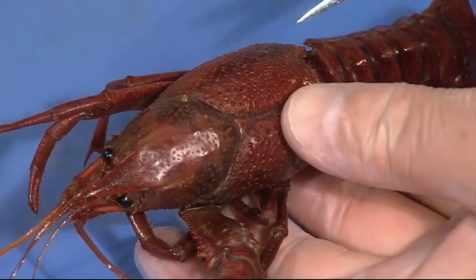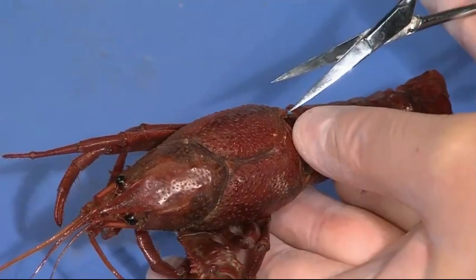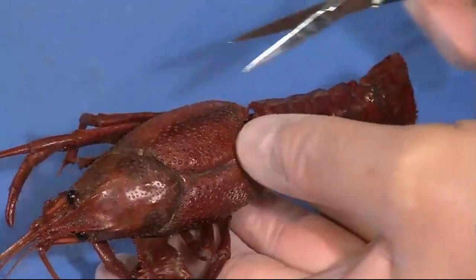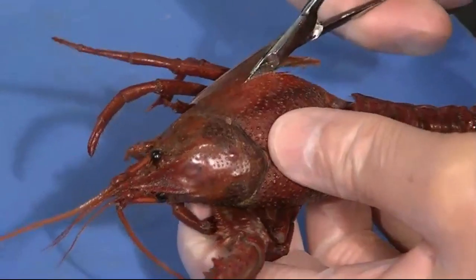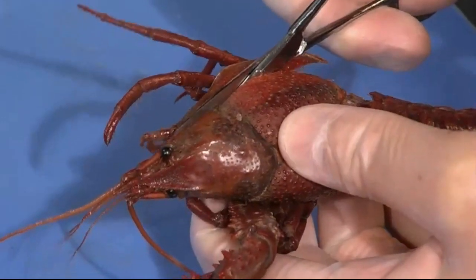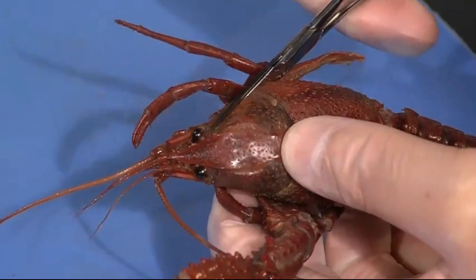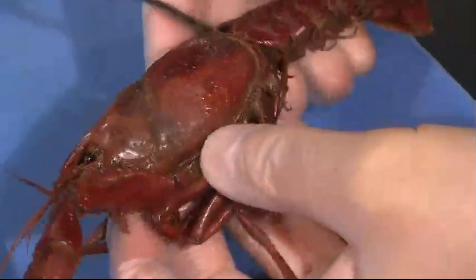I usually start with scissors, and what we want to do on the crayfish is cut through the carapace, the cephalothorax. Where the cephalothorax and the abdomen meet here, you can see there's a little gap and you can get the scissors under that. Then you want to cut forward along, about halfway down the side, and press up against the upper surface as you cut. I usually cut up to about the eye and then turn to the other side.